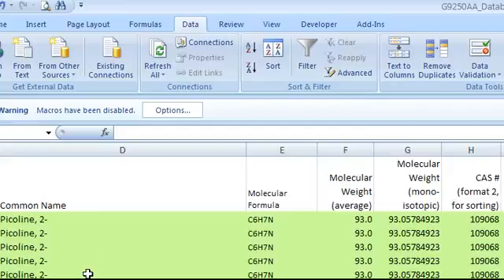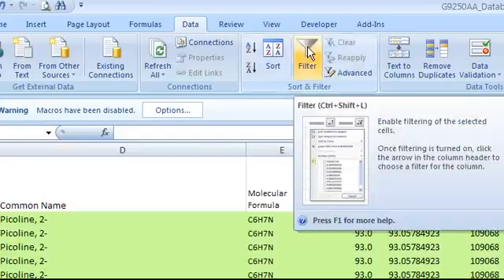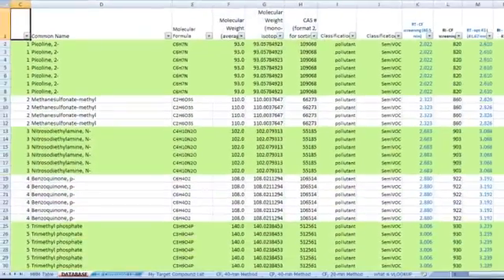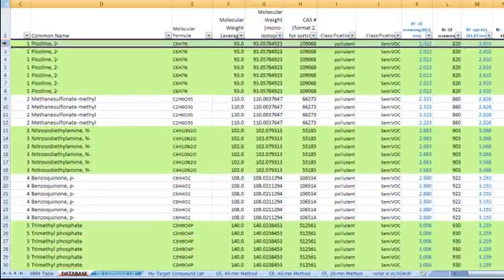When you open the database, you should make sure that the filtering function is turned on by pressing this button. There are over a thousand compounds in this database.